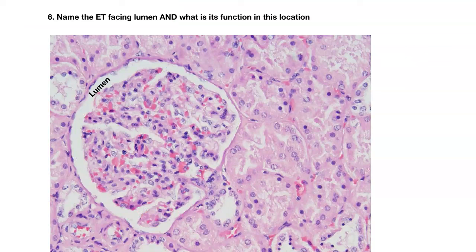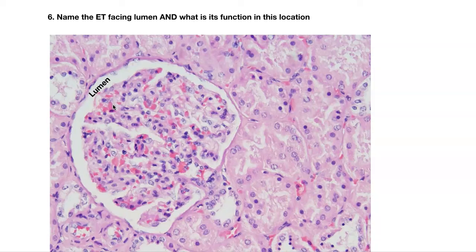Number six. Here's your lumen. Name this epithelial tissue facing the lumen, and — knowing what this is — what is the function of this epithelial tissue in this location? First name the epithelial tissue and its function in this location.